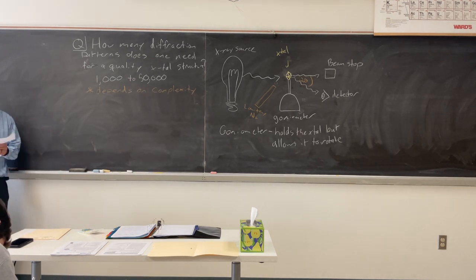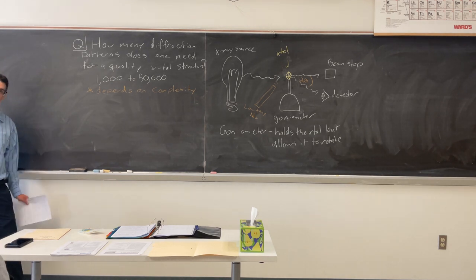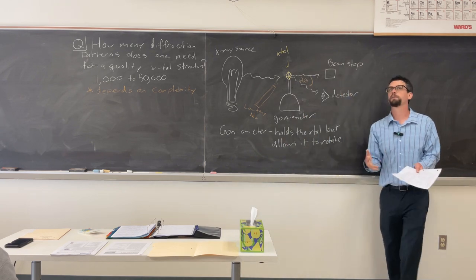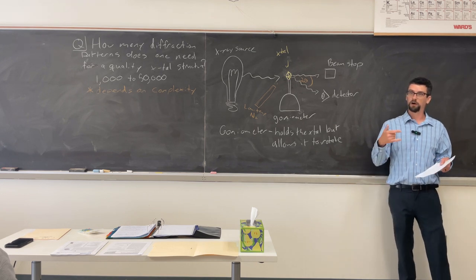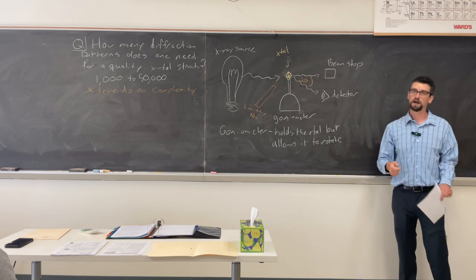And I know we've discussed this in the past, but what was originally used as the detector? Film. Yeah, film. So if you go back to the 70s when people were trying to solve a lot of this stuff, a lot of the people who are crystallographers are also really big into old school photography.